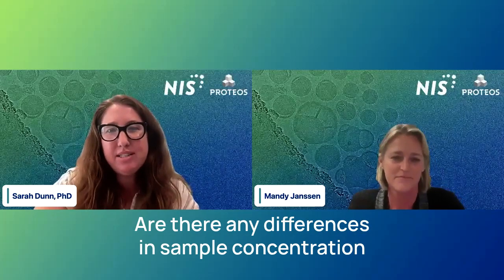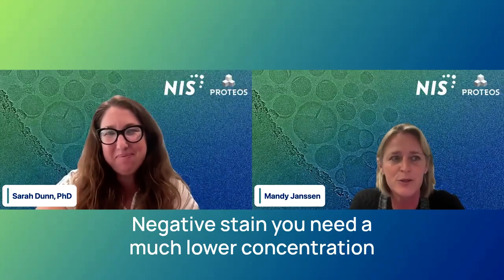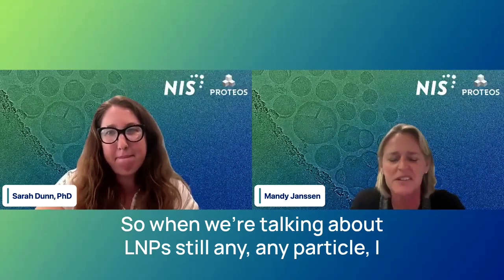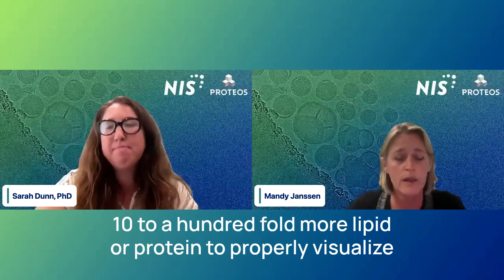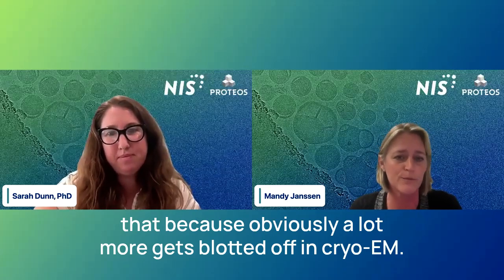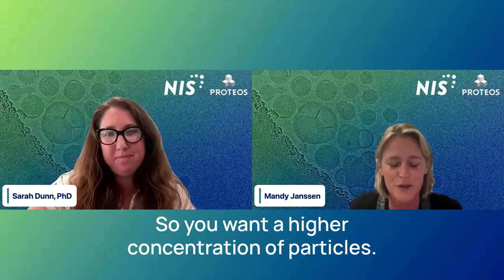Are there any differences in sample concentration requirements for negative stain TEM versus cryo-TEM imaging? Yes, for negative stain, you need a much lower concentration of particles. When we're talking about LNPs, or any particle, it's about a 10 to 100-fold difference. So if you want to bring your sample into cryo-EM, you need 10 to 100-fold more lipid or protein to properly visualize it. Obviously a lot more gets blotted off in cryo-EM, and it doesn't stick to the carbon layer, it has to go into holes, so you want a higher concentration of particles.